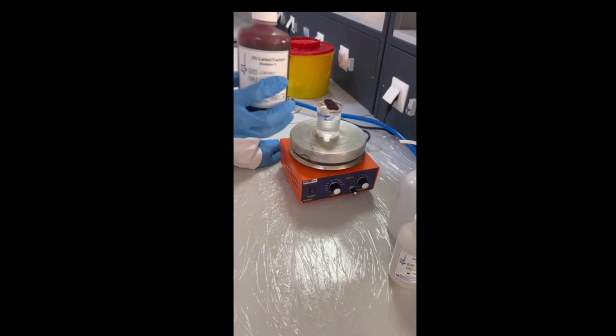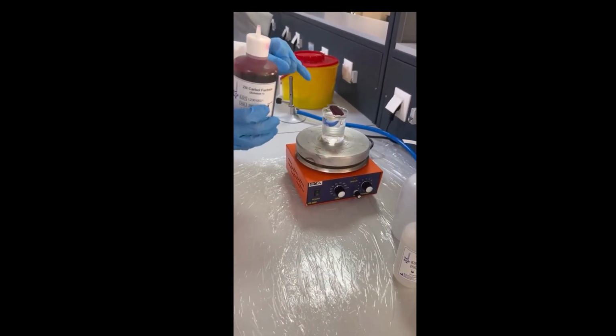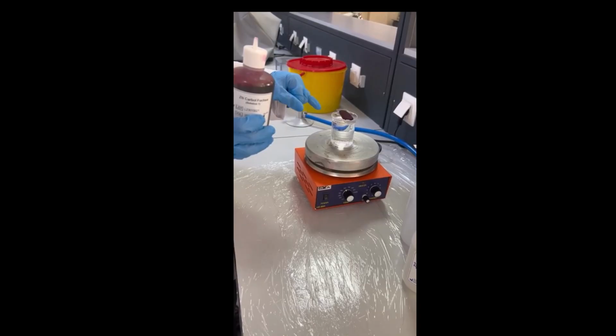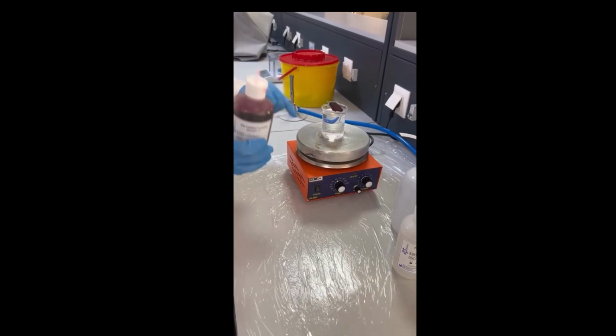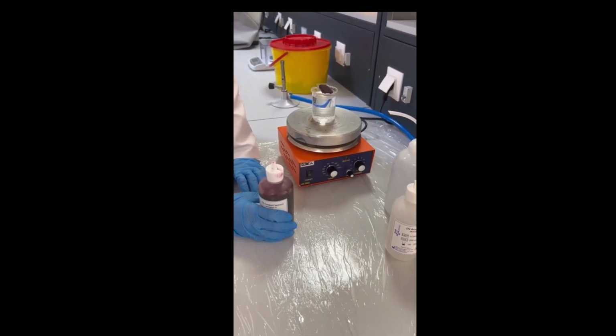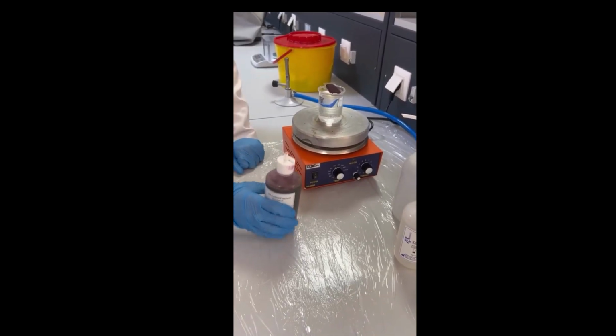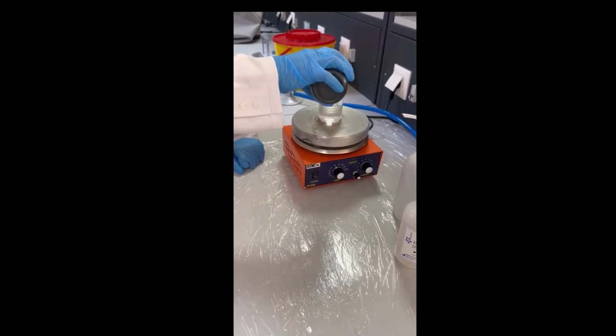What are the principles of this stain? This stain, with the help of the heat, enters the cell wall of the Mycobacterium tuberculosis. We don't allow the stain to dry. If the stain dries, we add more stain.